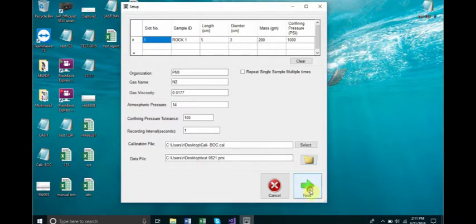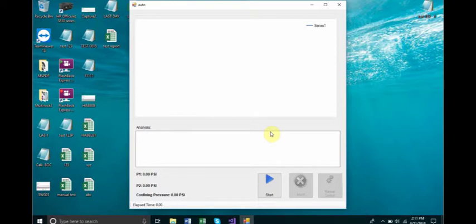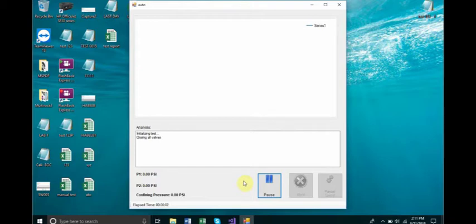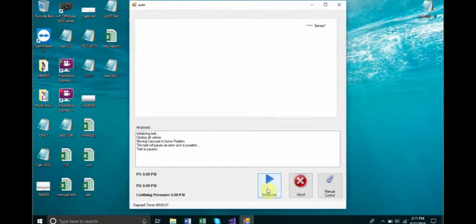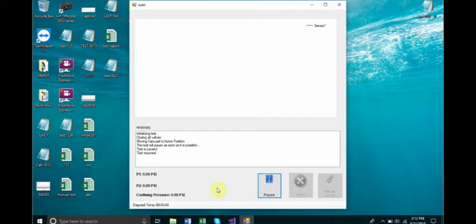On the following window, click the Start button. The carousel will move to the home position and begin the loading process. The user will be able to view test data in the analysis window as the test progresses. If at any point the test needs to be put on hold, the user may click the Pause button. This will halt test progress until the button, now labeled Resume, is clicked. If the test must be cancelled completely, the user may click the Abort button. The auto-test will run until all samples entered into the setup screen are tested. Each sample takes approximately one hour to test.